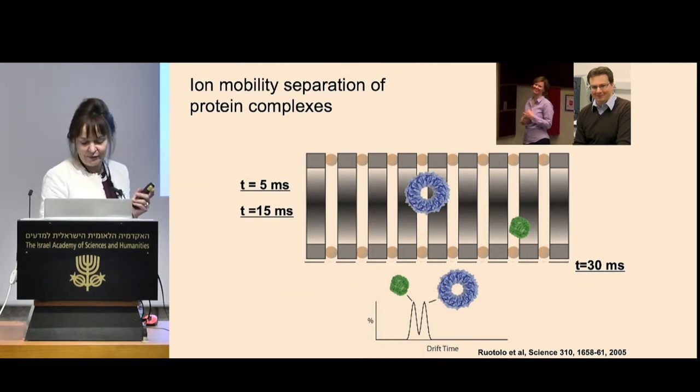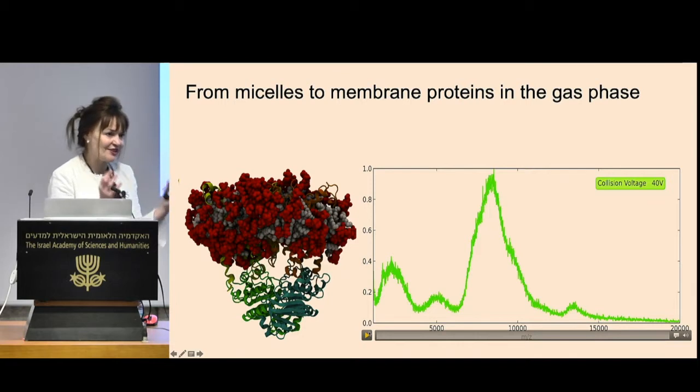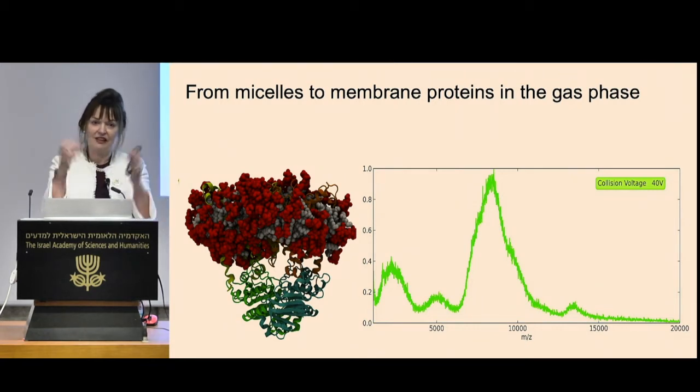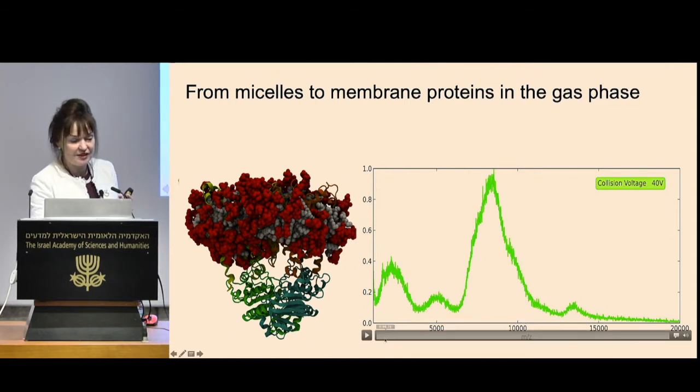And this actually first happened in the Cambridge basement. There's a lot of good things happen in there. Where there's no daylight, and it's not great, but where somebody decided that actually what you need to do is just make a sort of giant encapsulated bubble to take your complex from solution into gas phase, and then once you're in the gas phase, get rid of the outside of the bubble, which is the detergent.